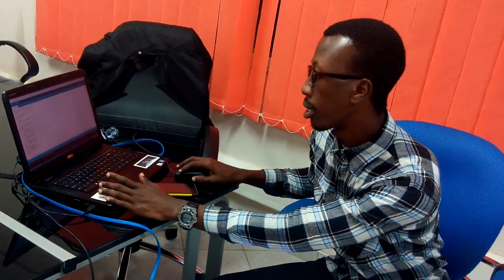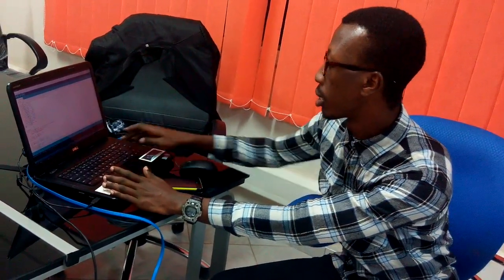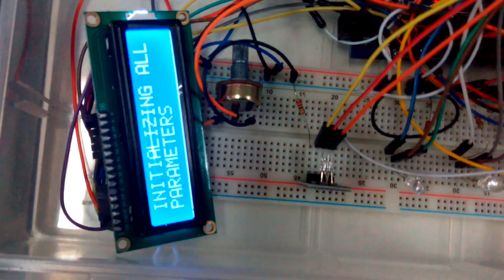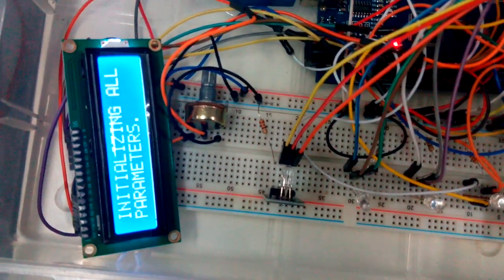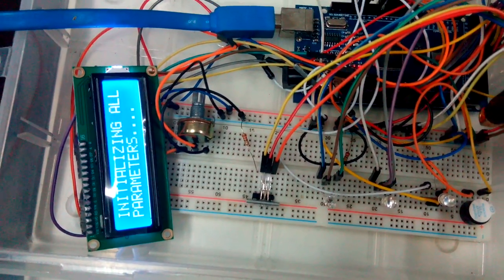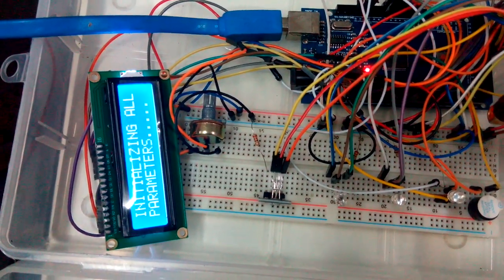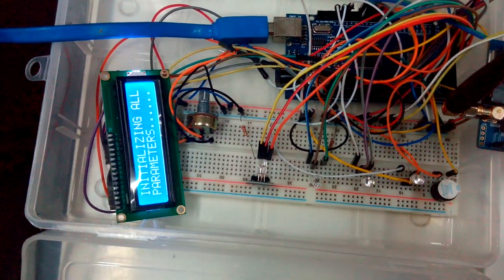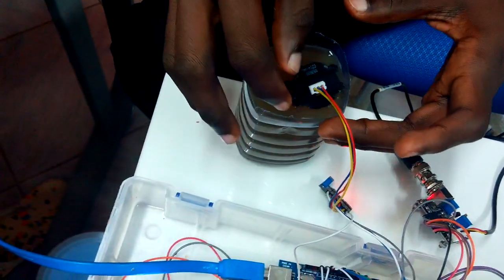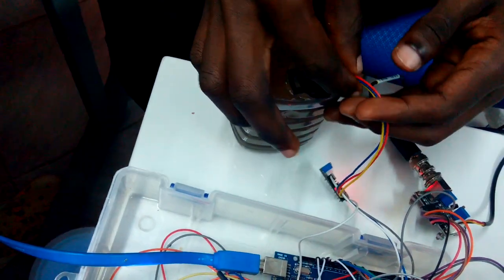I am now putting in the SMS initialization. We just want to make sure that everything is set and ready to go, then we upload the code. All parameters are now going to be initialized step by step — from the pH it goes to the temperature, then to the water level, and then to the turbidity. As it stands now, we have the turbidity showing dirty, the water is dirty, the temperature is cold, and the pH is normal.